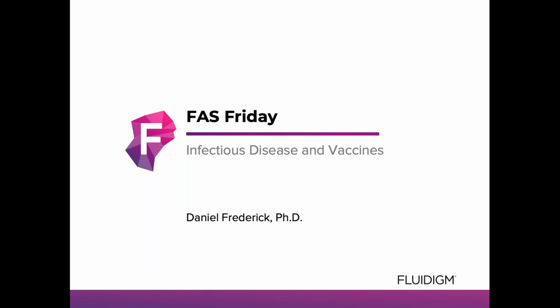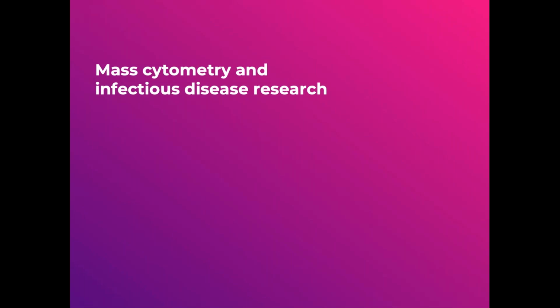First, I'd like to discuss how the use of mass cytometry and imaging mass cytometry enables the studies of infectious diseases and vaccines. So first, in the first section, we will look at mass cytometry and how it's applied to infectious disease research.